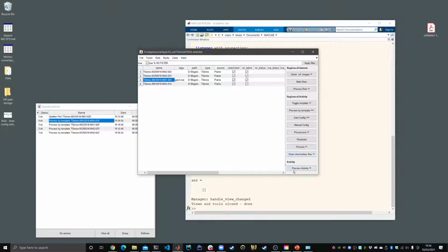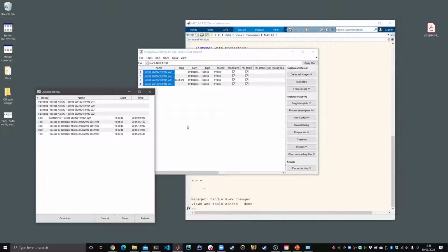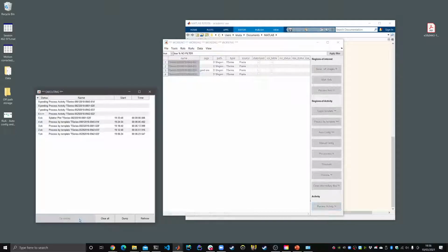However, if you want to combine the RoA mask with the RoIs that we have already marked, we're going to have one last step, and that is this step here called activity. We're going to choose all the series we want and do a batch processing of activity. Once this is done, it looks at all the RoI groups, such as gliopil or astrocyte somata, and it will generate statistics and traces for each of those compartments, in addition to the signal in individual RoIs. So we're going to do that processing now, and then finally at the end we can look at some traces.